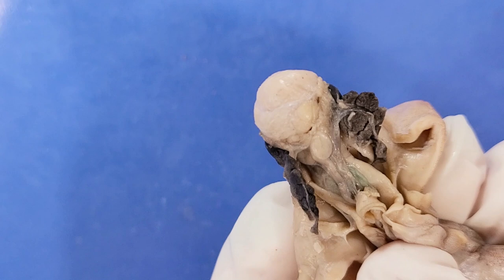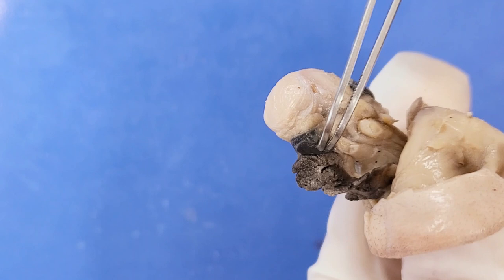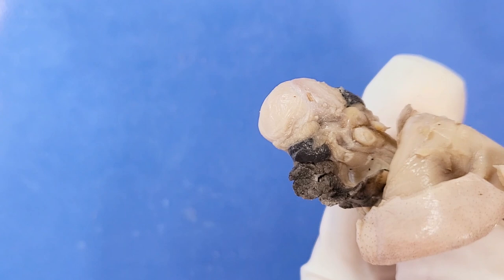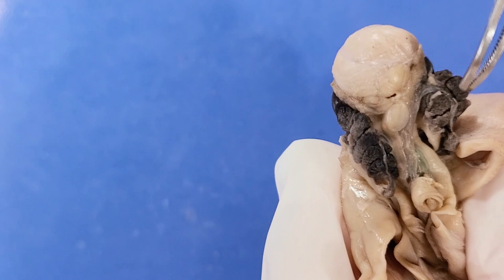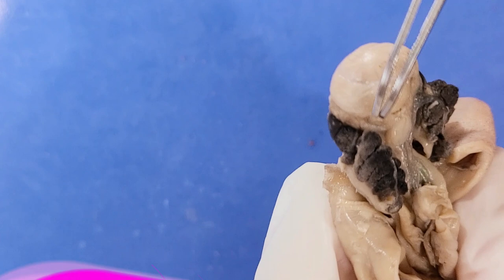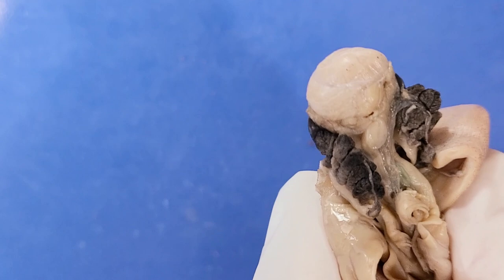Above each of the gills, you can see these triangular dark structures. So one here, and you can see another one on the other side. So right here. These are the branchial hearts, which pump blood specifically to the gills. There's also a systemic heart, which pumps blood to the rest of the octopus, which you can see right here. So this structure way up top, this round circular structure, is the gonad, or reproductive organ. This would be the testis in males and the ovary in females. So since this octopus is a female, this would be an ovary.